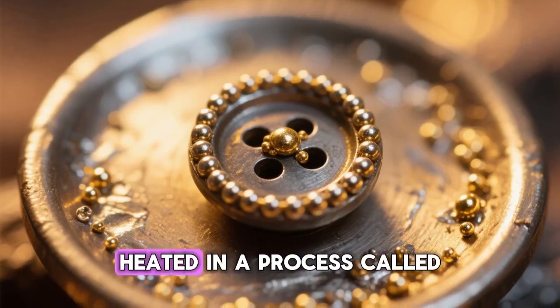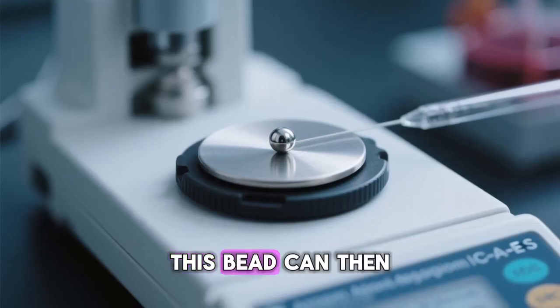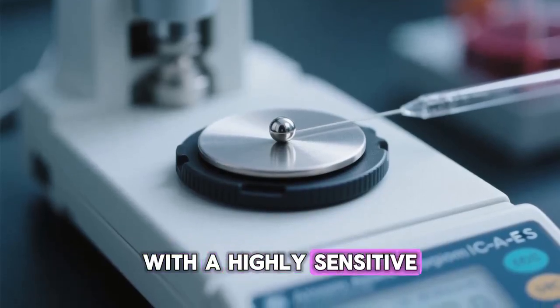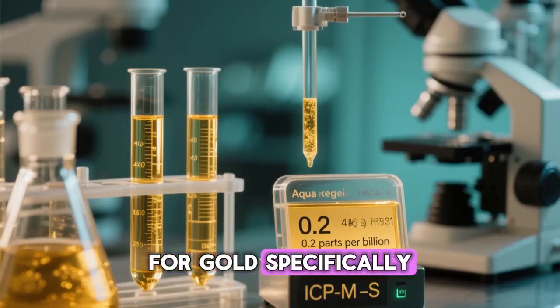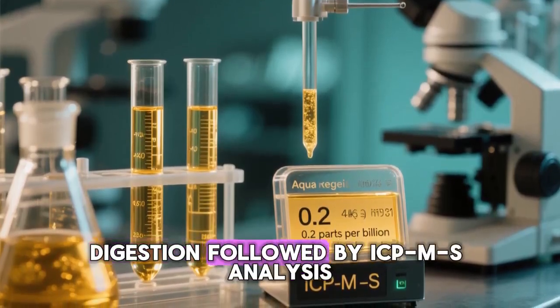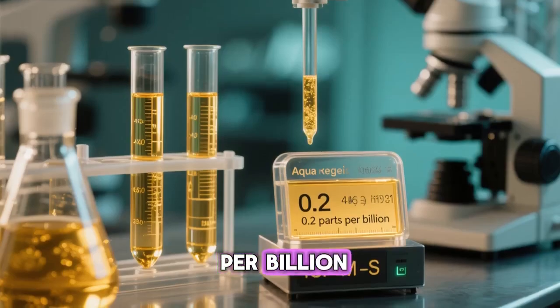This button is then heated in a process called cupellation, which leaves behind a tiny gold or silver bead. This bead can then be weighed, or it can be dissolved and analyzed with a highly sensitive technique like atomic absorption spectrometry or ICP-AES. For gold specifically, we can also use aqua regia digestion followed by ICP-MS analysis, which can detect gold down to about 0.2 parts per billion.